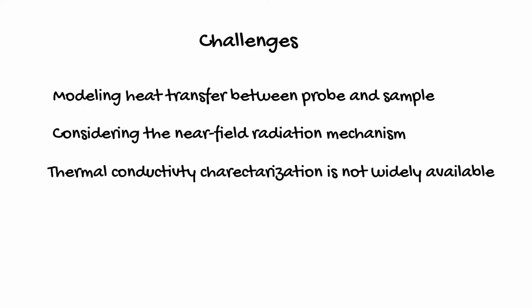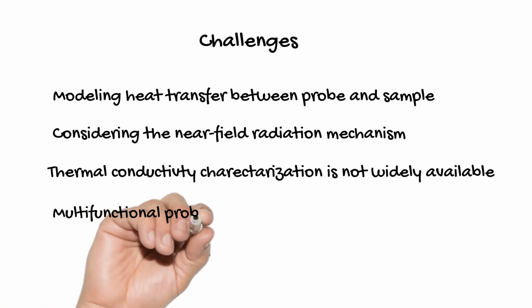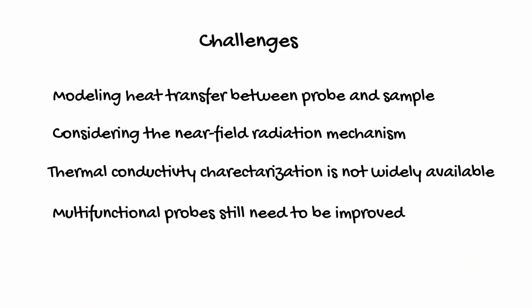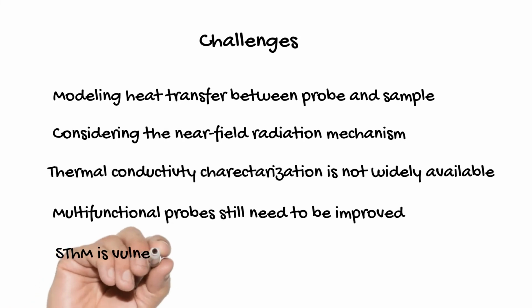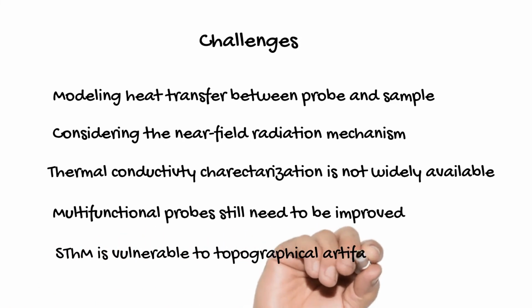The fourth challenge is the fact that multifunctional probes are not improved enough to allow simultaneous measurements, such as chemical and electrical properties, in addition to the thermal characterization. The last challenge is that sometimes inaccurate measurements are produced due to topographical artifacts.